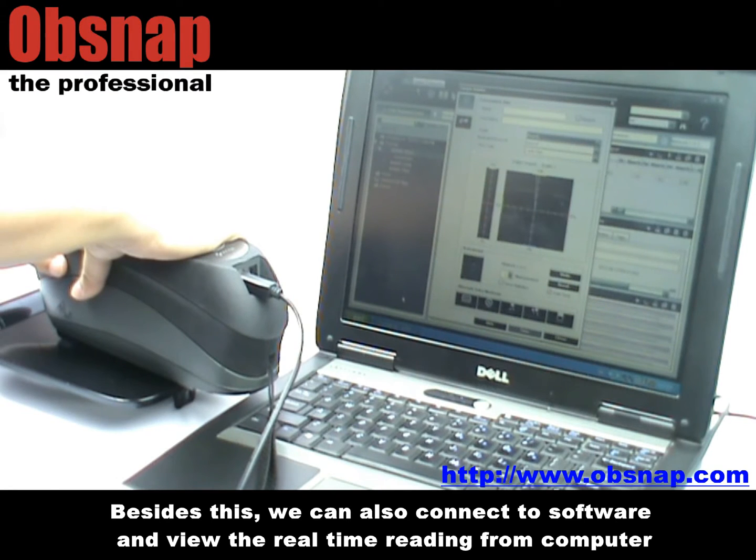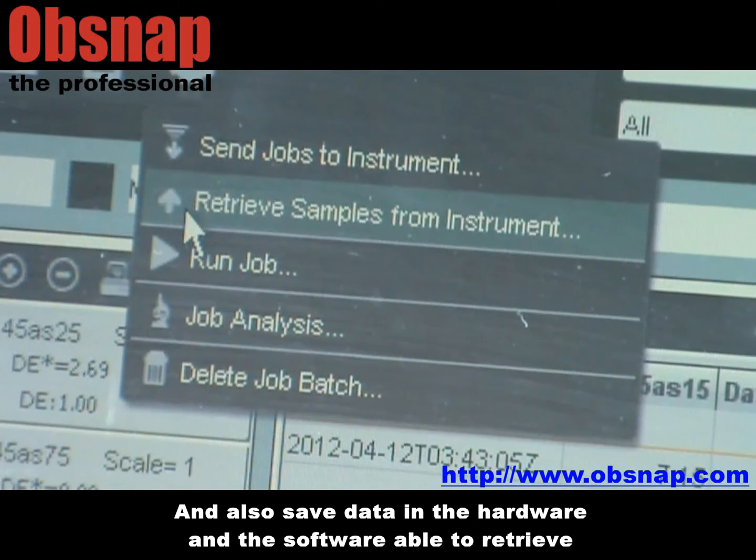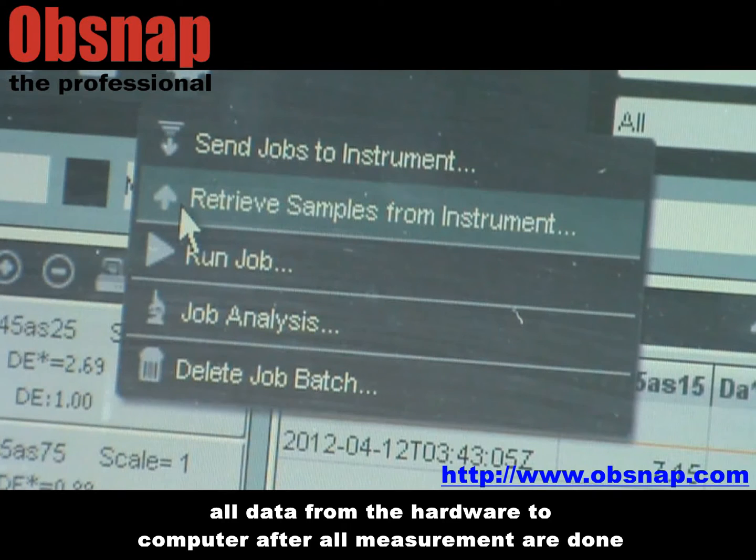Besides this, we can also connect the software and view real-time readings from a computer, and also save data in the hardware. The software is able to retrieve all data from the hardware to the computer after all measurements are done.